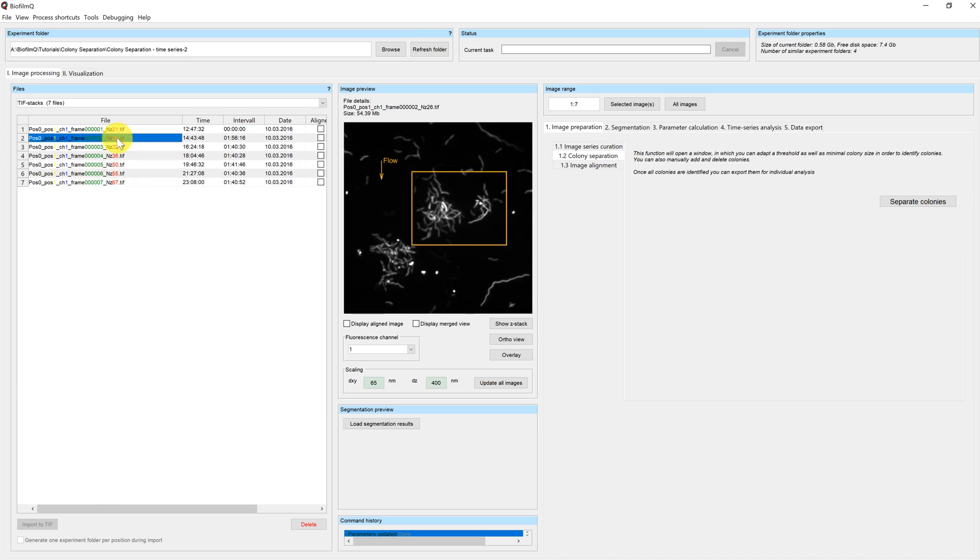This was our short introduction to colony separation. For additional information on the other functions of BiofilmQ, please refer to the other tutorials.